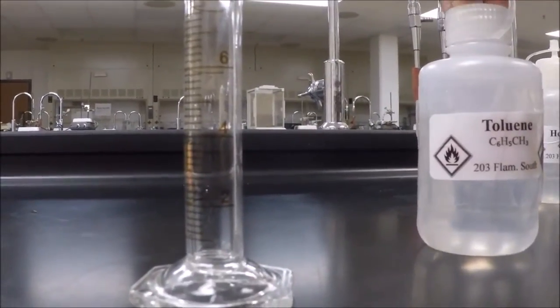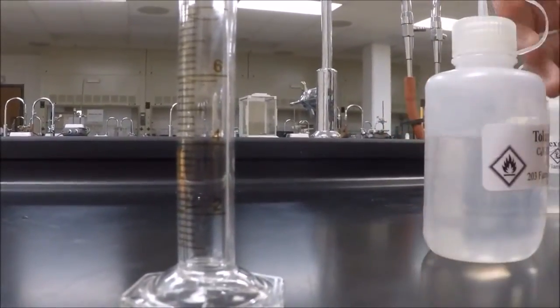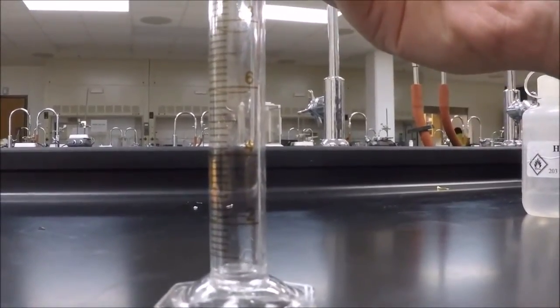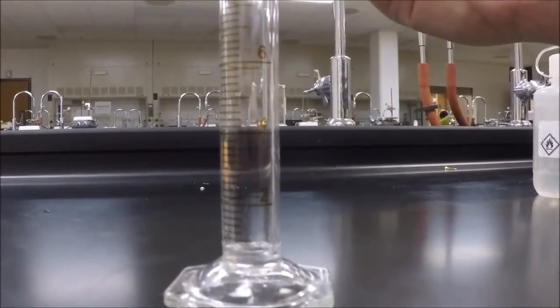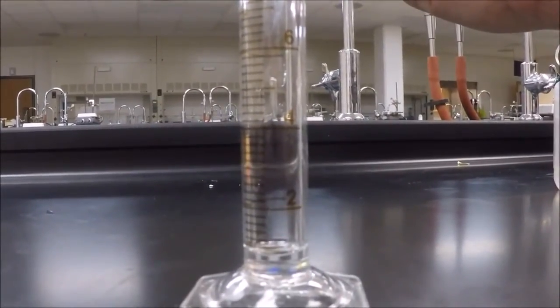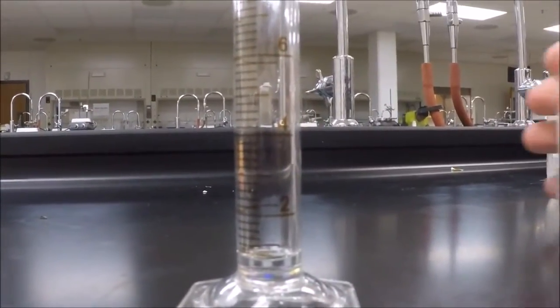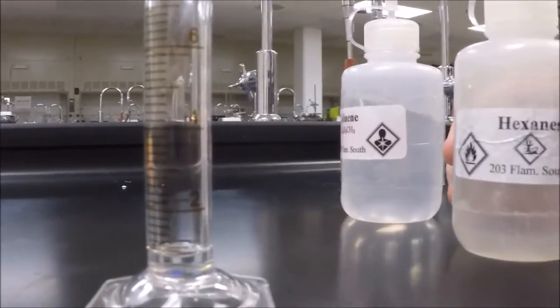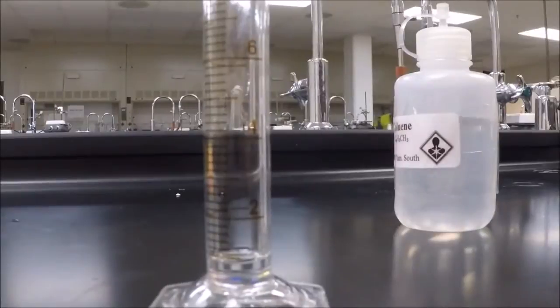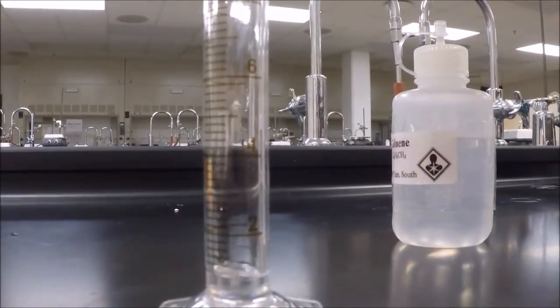We're going to make our solution for the distillation. You're going to take one milliliter of toluene and add it to your graduated cylinder. Then you're going to take one milliliter of hexanes and add it to the same graduated cylinder, making a total of two milliliters of solution.